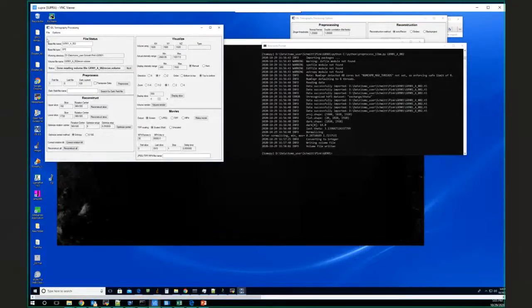If we went to a thinner scintillator and also higher numerical aperture lenses, you're limited just like you are in an optical microscope, right? If you want to get to a 0.5 micron resolution with an optical microscope, you need a very good, big numerical aperture lens. And typically those are not long working distance. So you saw in this setup, we have a 45 degree mirror, which means that with my 5x objective, I'm pretty close to the mirror. If I wanted a higher numerical aperture lens, I would have to get rid of the mirror because a high numerical aperture lens doesn't have a long working distance. Then the objective and the camera are directly downstream of the scintillator, no mirror, and now you have to worry about beam damage to your lens and your camera. That's why we have the mirror.